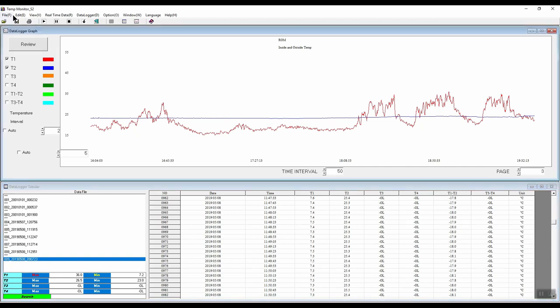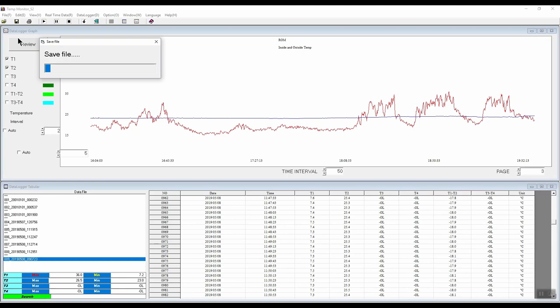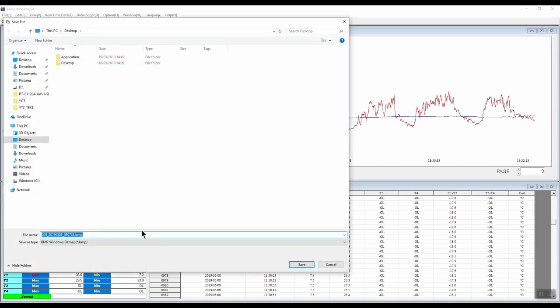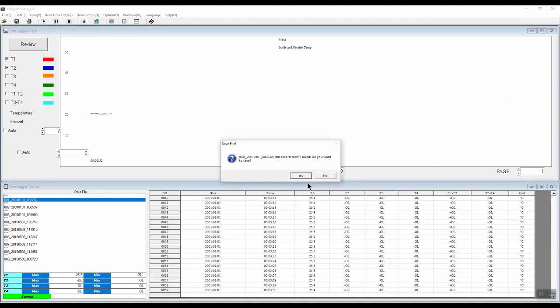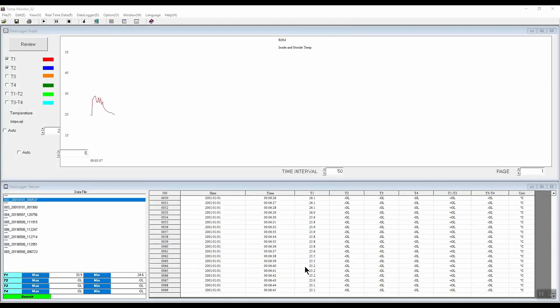We can save the graph and spreadsheet view by clicking on file and then save data. We give it a name — let's call it test data — and change the format to an Excel spreadsheet, then click save. Once the file has been saved, click OK. Then go file, save graph, give it a name such as test graph, and click OK. We can now exit the software — it'll ask if we want to save the data, click yes, change it to Excel spreadsheet. That's another way of actually saving the data.